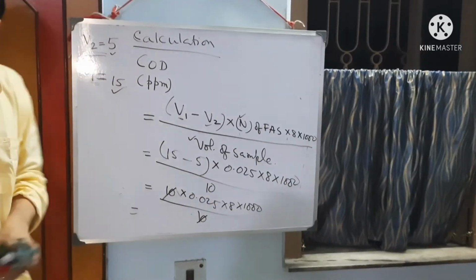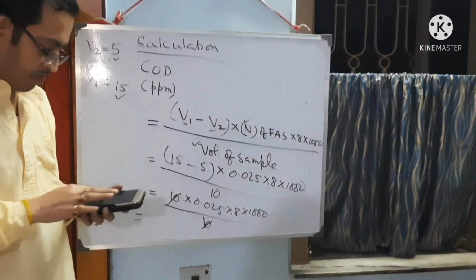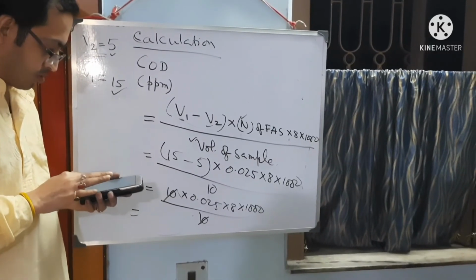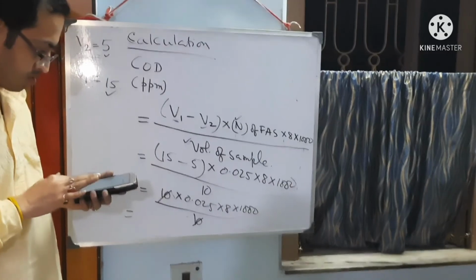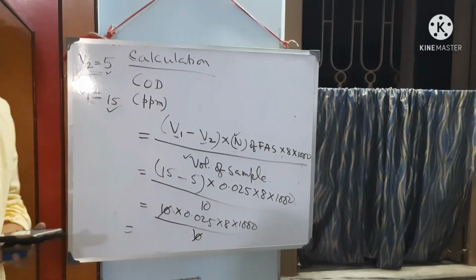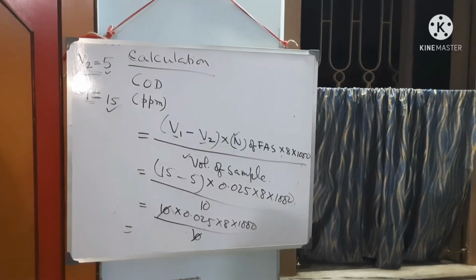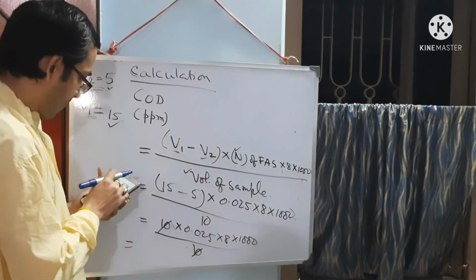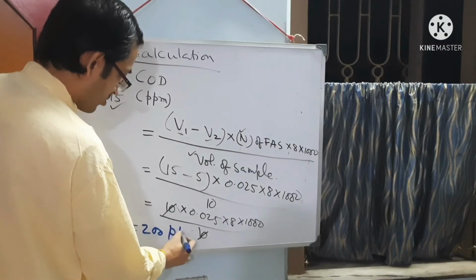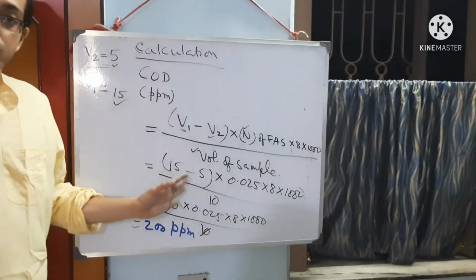So we have to calculate this. So this is the calculation for COD.